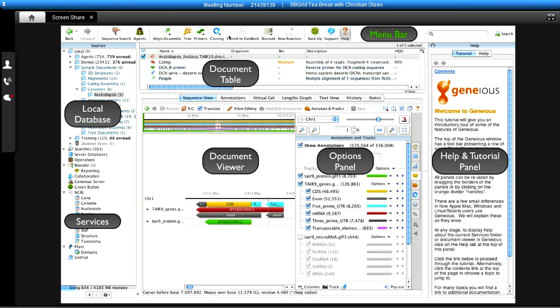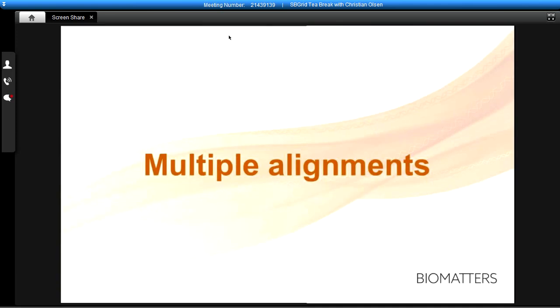When I first started using Geneious, I was actually a user for 4 years before I jumped on board. The longest I ever had to wait to have an answer for a support issue was about 4 hours, maybe 4.5 hours. And this was something very striking to me. So we're getting rid of that lonely grad student syndrome in the lab.